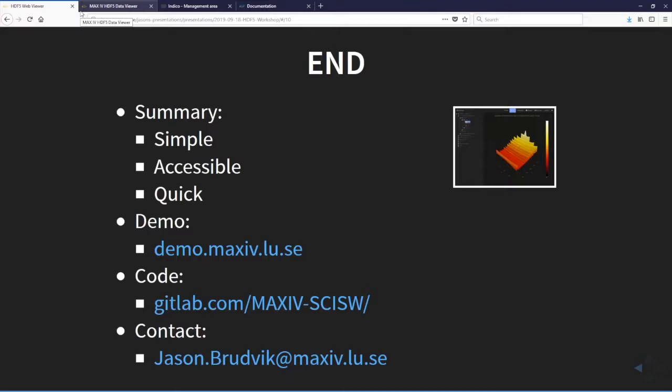This is a lysozyme sample. It's for the water buffer. It's from a PM29 beamline. It's been analyzed by a program. And here it's a Nexus file, and you have the same: a default plot, but you also have here what's been measured, and access to the images.